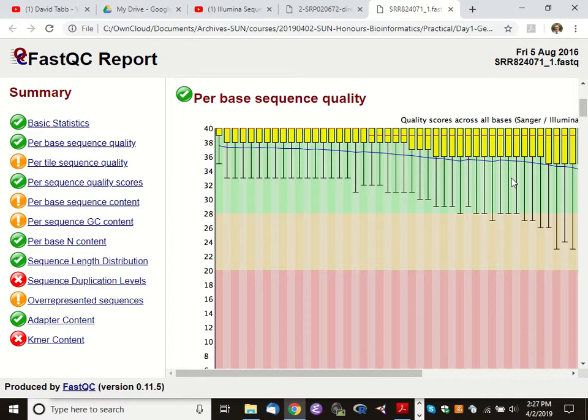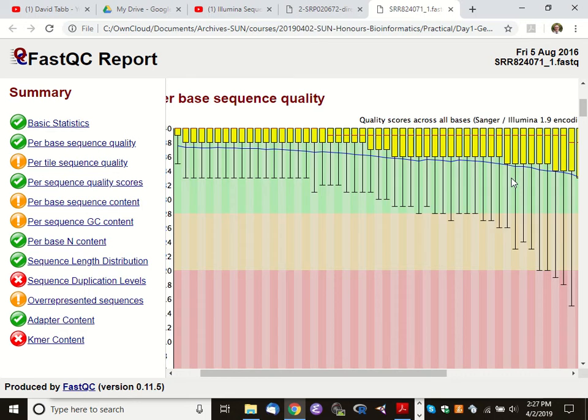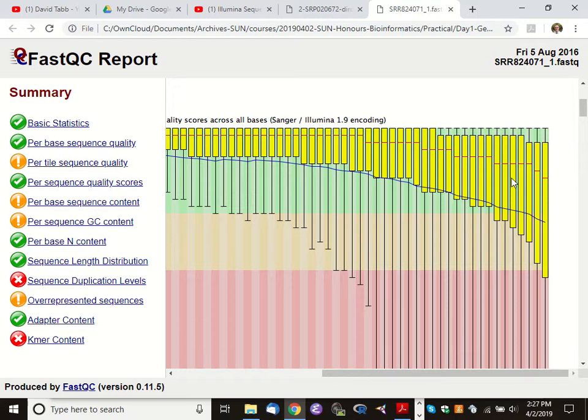It's accurate enough, basically. So what it's showing then is that the median, as we go further and further along in these reads, is starting to sag below 40 about the time you have 20 nucleotides. And by the time you get all the way over to the right, to the 72nd letter, you dip down into the 30s pretty far. So what would you do if your sequencing data came back and you saw that you were all the way down in this red region with the scores at the 3' end of the reads?